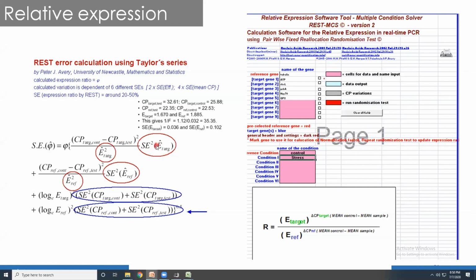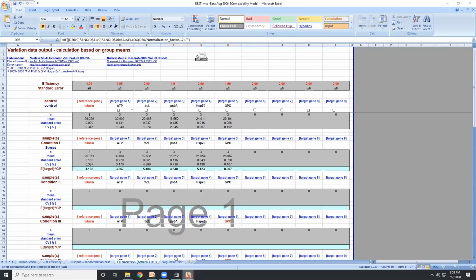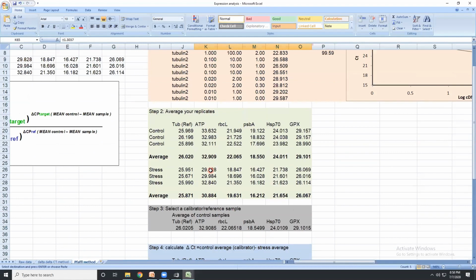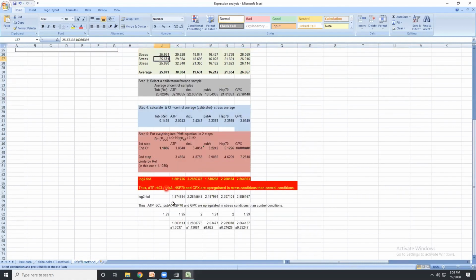And you will see that by changing the different combinations of the replicates you are providing, it is also giving you standard deviation. However, in case you want to get the standard deviation and standard error data, instead of making it an average of 3, you can also go one by one. So 1 to this one, second to this one, and third to this one. And at the end, whatever average comes for the 3, you can report it as a standard deviation. This is one thing.